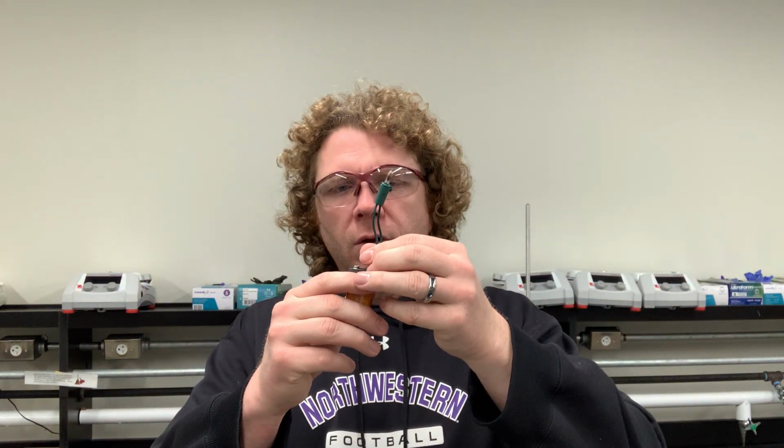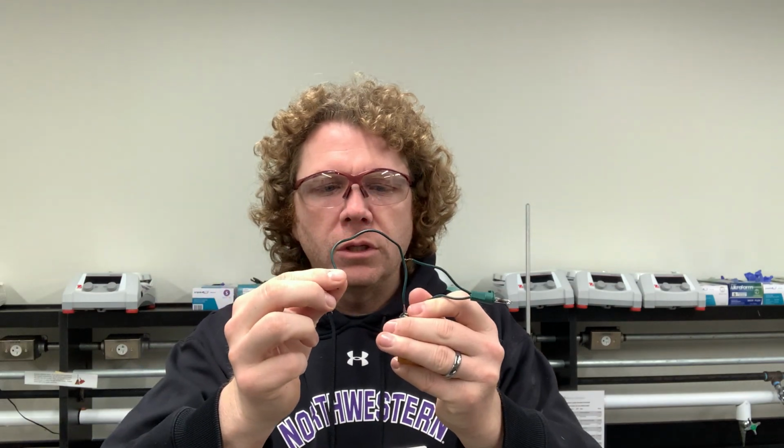And so what we're going to do is thread our wire from our battery to our solution, and then with this other wire from our solution to the other end of our battery. And if that light turns on, then we have basically affirmation that our system is working and that that solution is behaving as we expect it to.